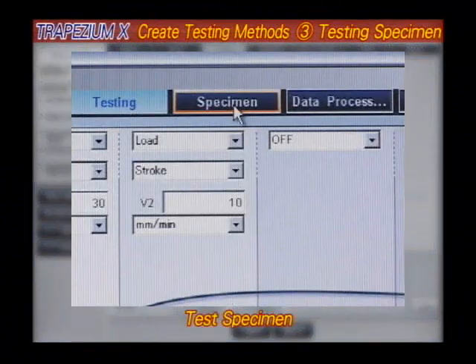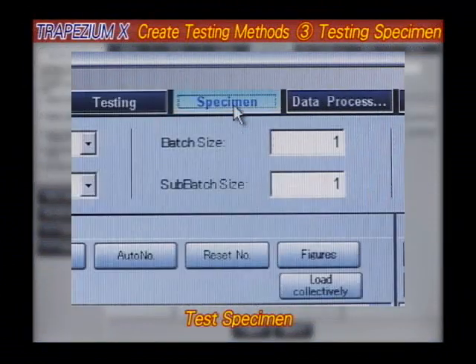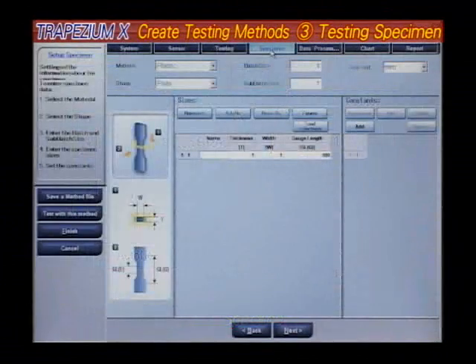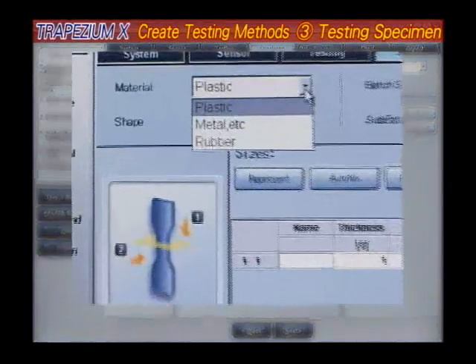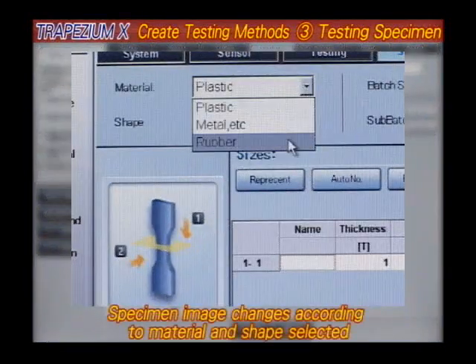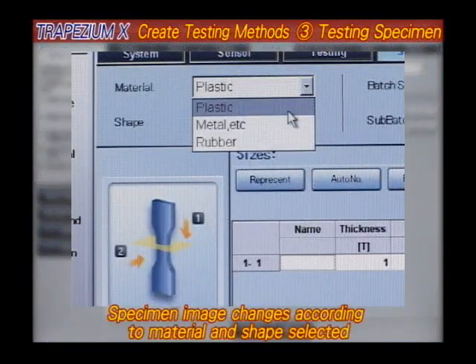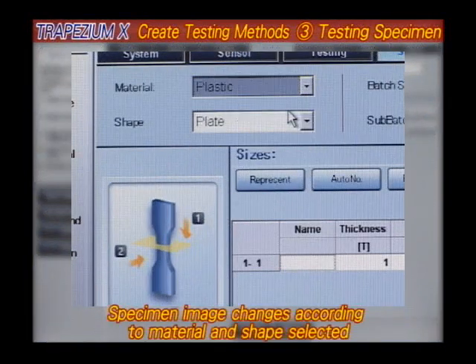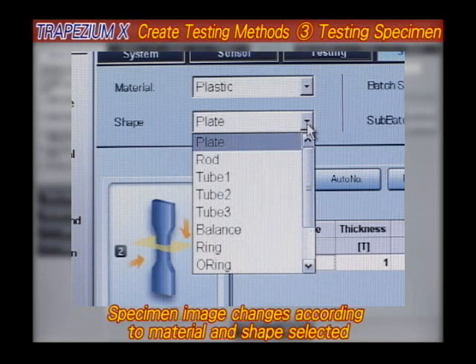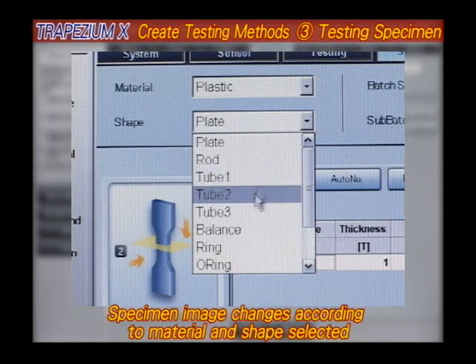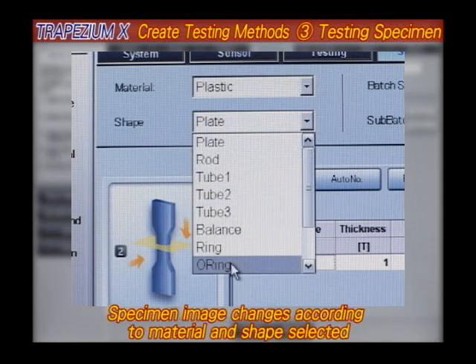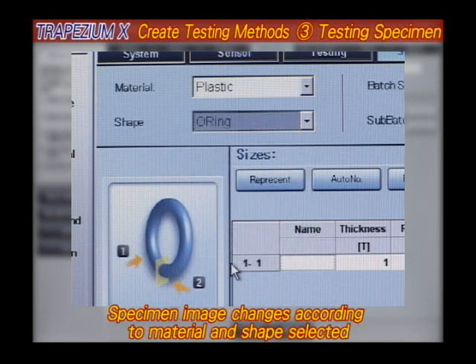Test Specimen. In the window, you can specify the number of tests performed as well as the specimen's material, shape, and dimensions using the clear, simple illustrations shown here.